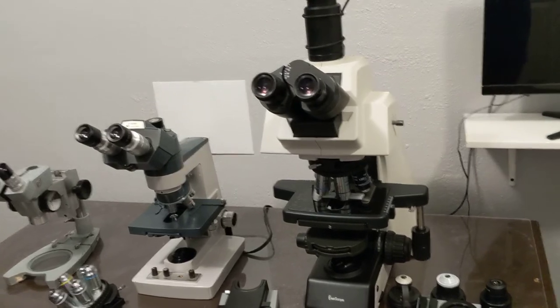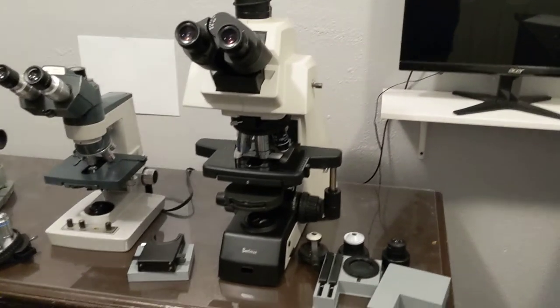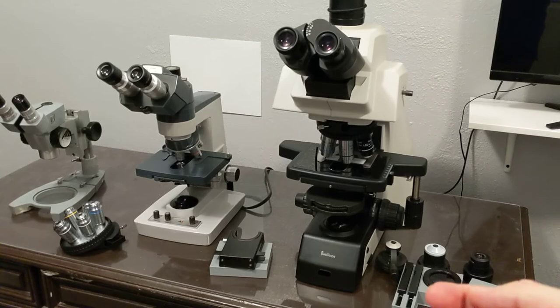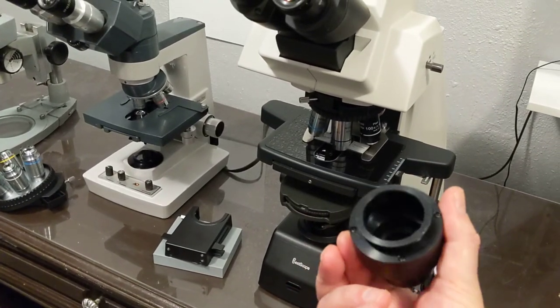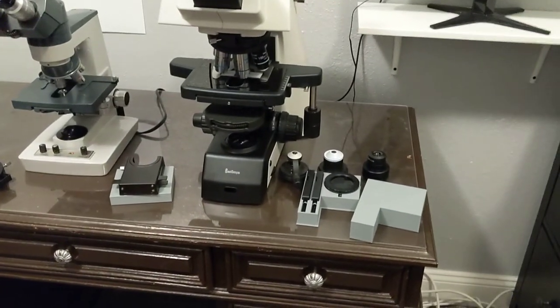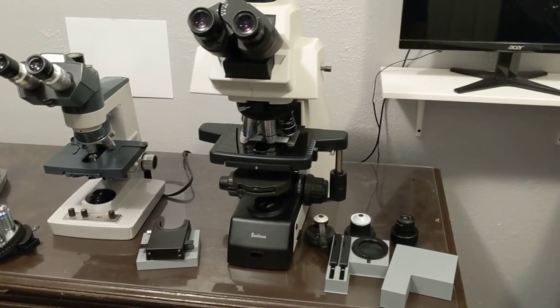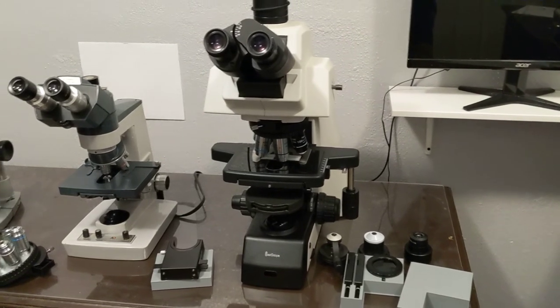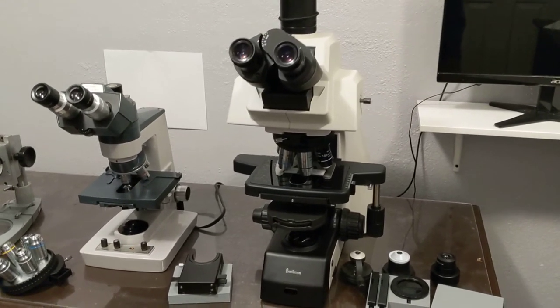What do I miss? There's one other thing I miss, and that is it's not that easy for me to use stop patches, dark field or oblique illumination. In the American Optical, there's a little slot that you slide it in, and you can even put a polarizer there and rotate it. These condensers don't have any sort of filter holder like that. They've got some space between the bottom and where the actual diaphragm is. I need to 3D print some kind of a cylinder. Each of the condensers has a different diameter, so I need to figure out exactly what I'm going to do with that. I don't use dark field as much as I used to because I get a lot of that with phase contrast or DIC.